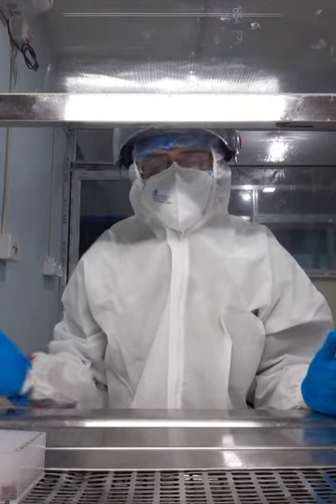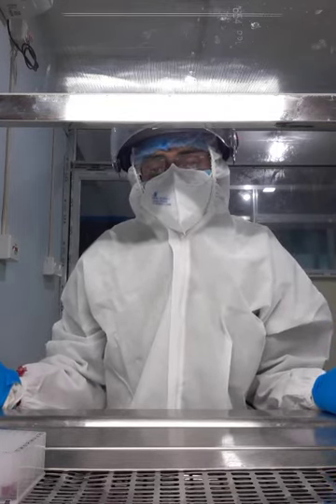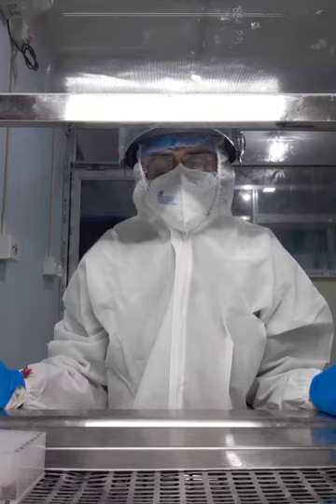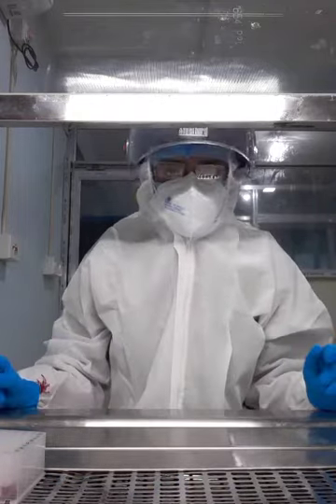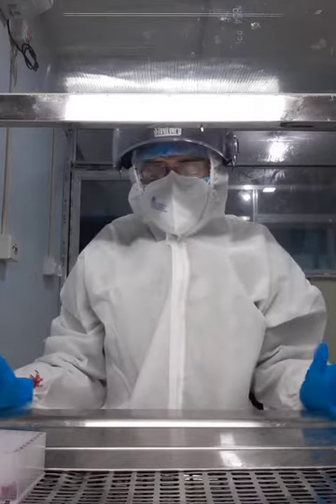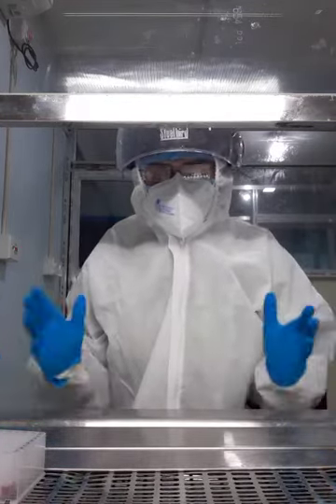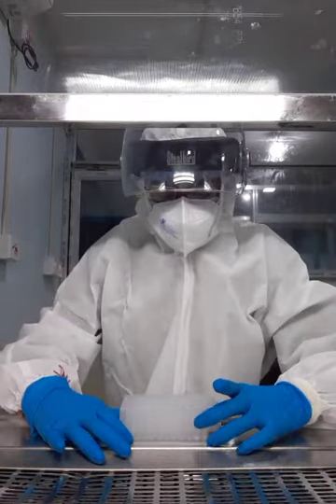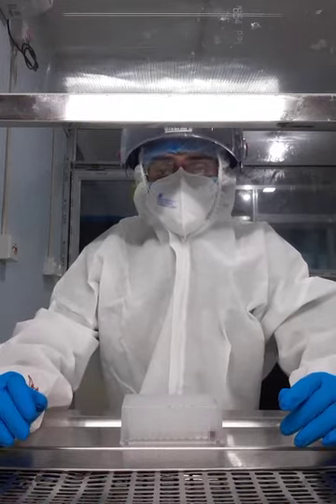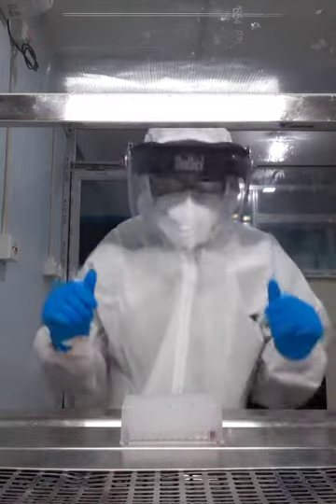If you have 10, 15, 20, 30, 40 or 90 VTM samples, you have to take a pen and paper and write the ID number. In one single deep well plate, you are able to test 96 VTM samples at a time. Okay, so it's time to put the VTM sample.